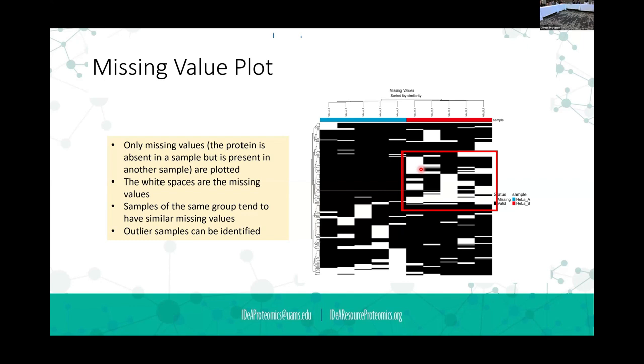Good question. There are certain proteins which are highly abundant in a sample, but they don't get detected in the mass spec. Sure. I always blame glycosylation. And so there are certain proteins that don't digest well by trypsin. One are glycopeptides, proteoglycans more specifically. So a proteoglycan has more sugar on it than protein.